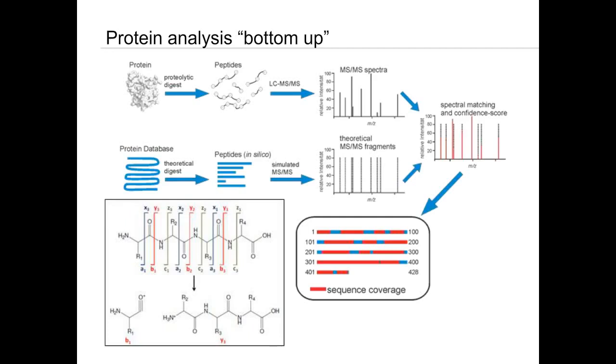And this is in general done by the so-called bottom-up proteomics approach, which some of you might already have heard of. I'd like to give a brief overview for all of those of you who might not be familiar with this technique. So the idea is basically to build up the protein sequence and the proteome, if you want, by digesting the proteins using specific proteases such as trypsin to peptides, identify the peptides and build up the sequence from the bottom up. Therefore, this name, bottom-up proteomics.